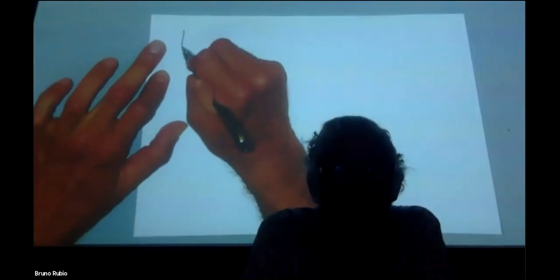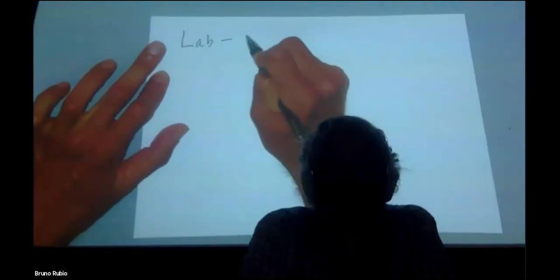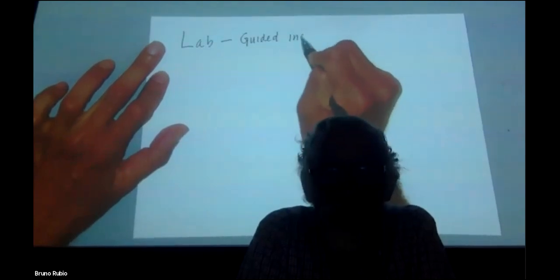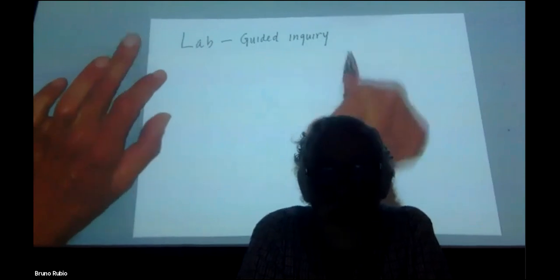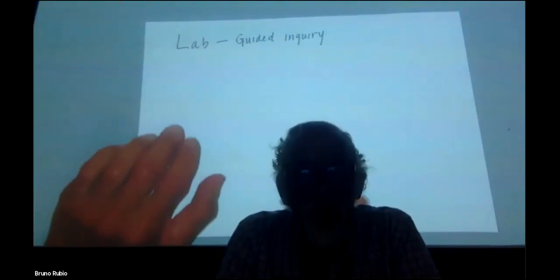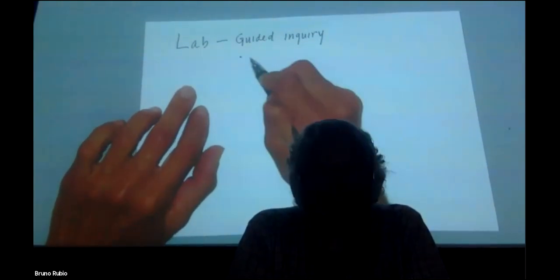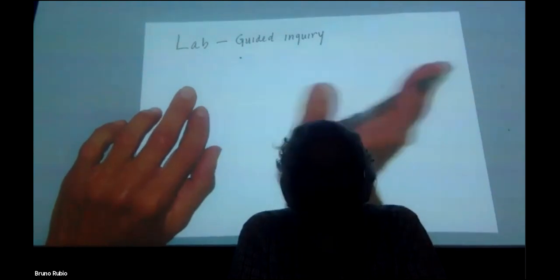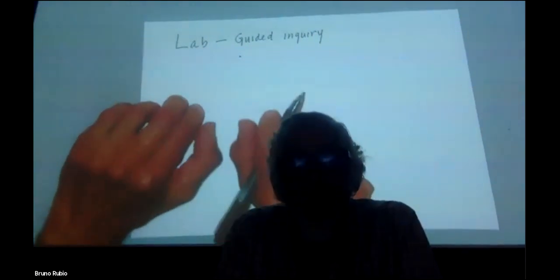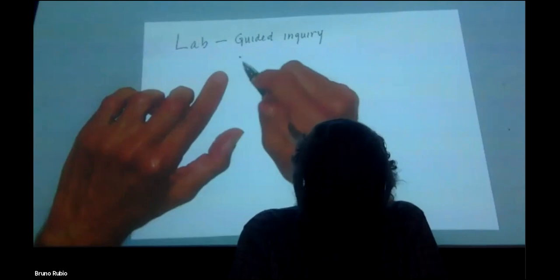Okay, so the philosophy of the lab is that of guided inquiry. Not every lab is going to be the same. You'll see this first lab is going to be quite different from something that you might think of as a chemistry lab.